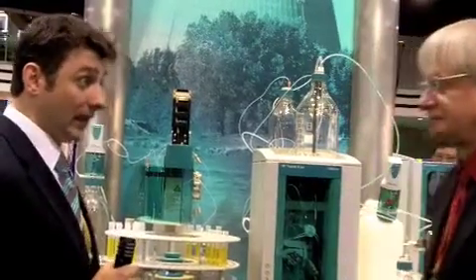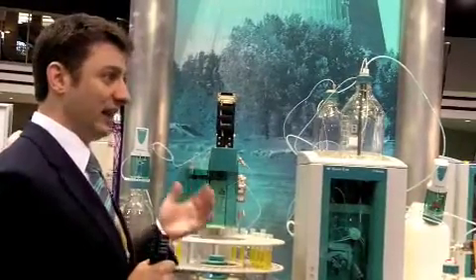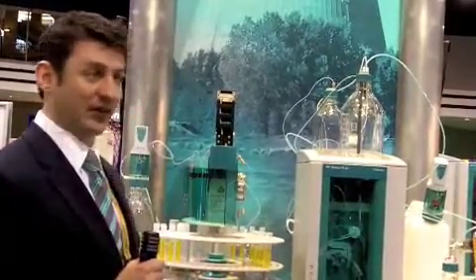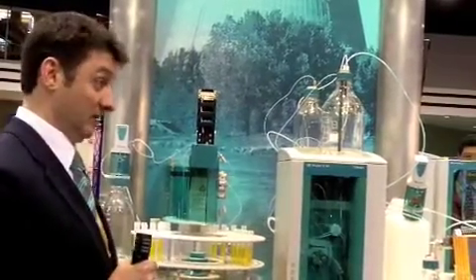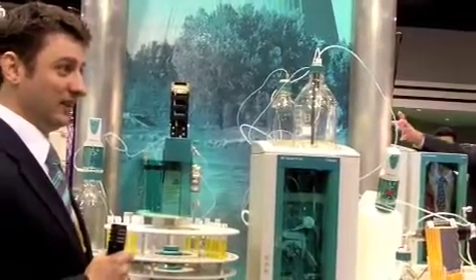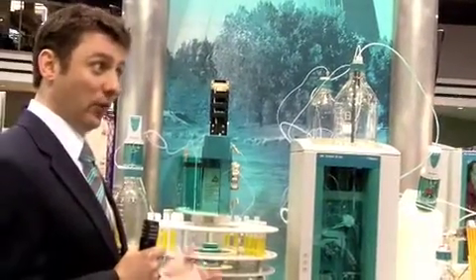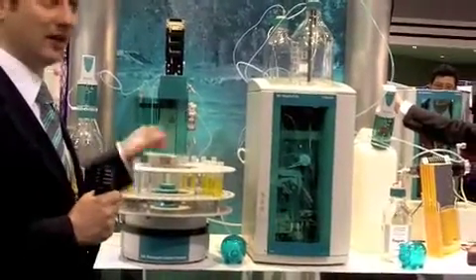What would be the one or two main things you'd like to get across to your customers about this product? For large volume analysis, it saves laboratory staff time, gives you better precision and better accuracy. If you're in the contract analysis business, time is money. You're going to reduce your consumable and running costs for the instrument by 95% by automating this entire procedure.